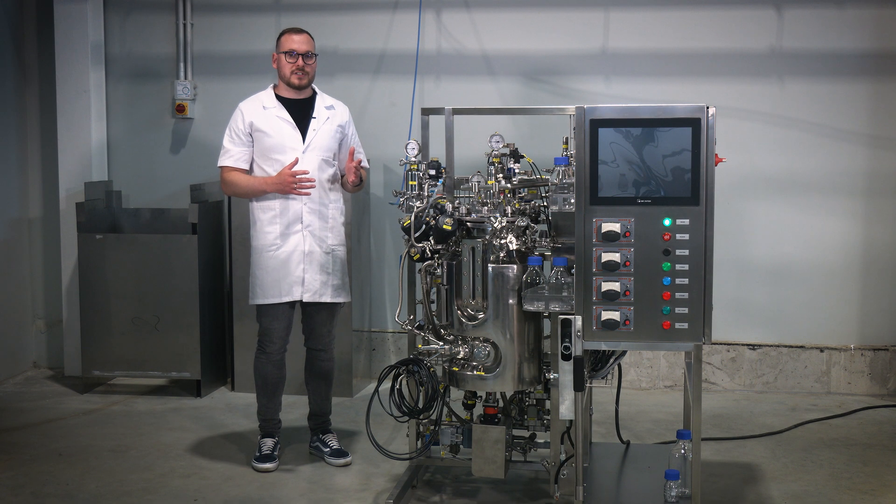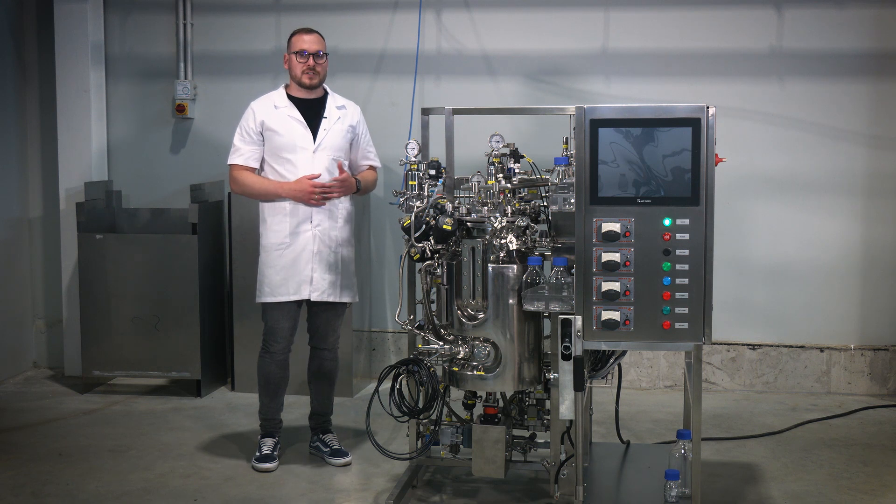Service connections. In this segment we will cover the service connections and power setup for the stainless steel bioreactor.